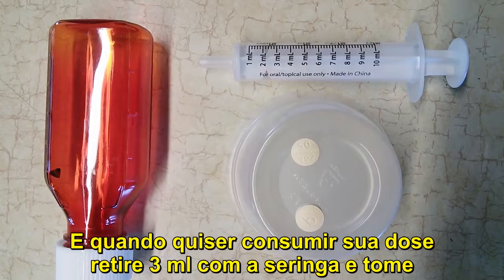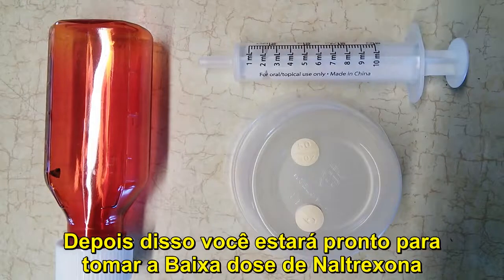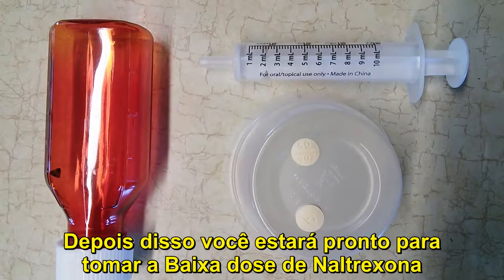It'll dissolve, and then when you're going to take your dose, all you have to do is draw up 3 milliliters into this oral syringe, swallow it, and you're all set to take a dose of low dose naltrexone.